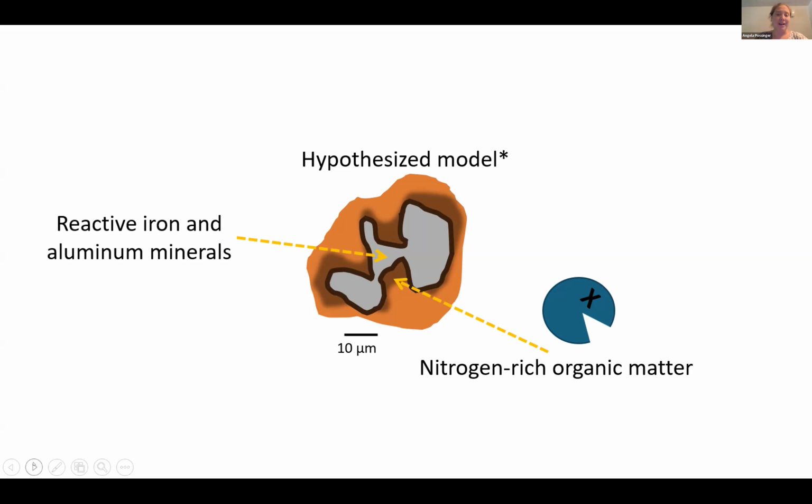So for this project, we used a combination of EDX for more overview mapping, and then at the very high resolution scale, scanning transmission electron microscopy with electron energy loss spectroscopy, STEM EELS, which has really, really small sub-nanometer scale spatial resolution. In crystals and other more regular materials, potentially down to angstrom scale, a single angstrom or less.